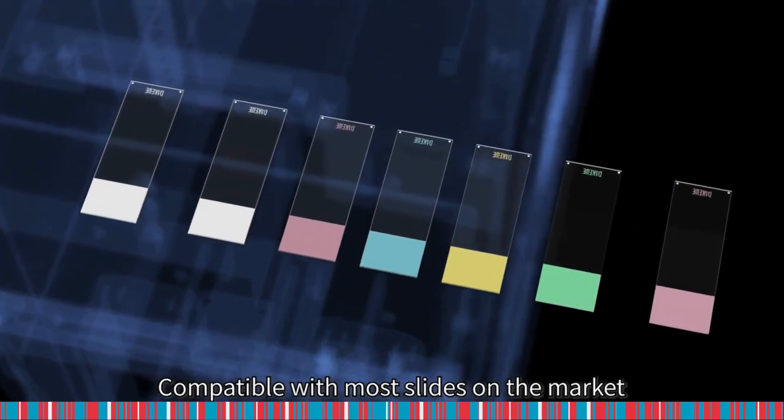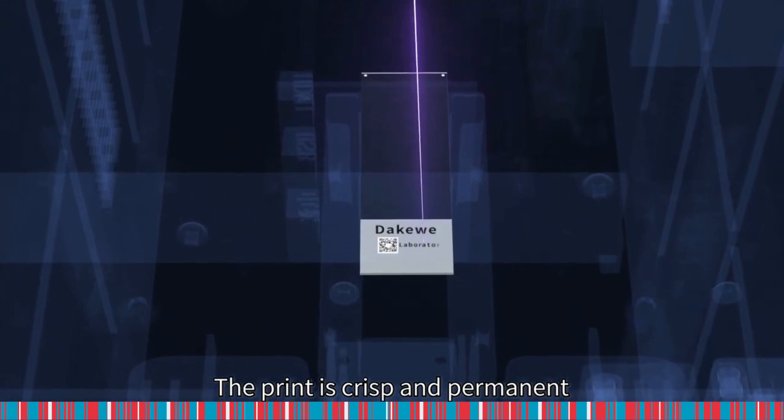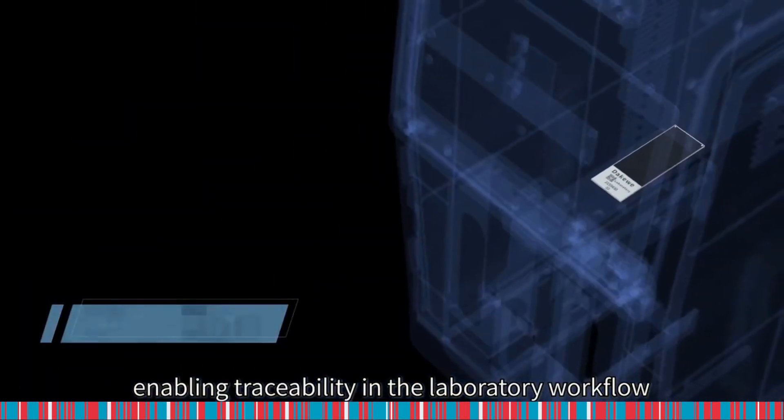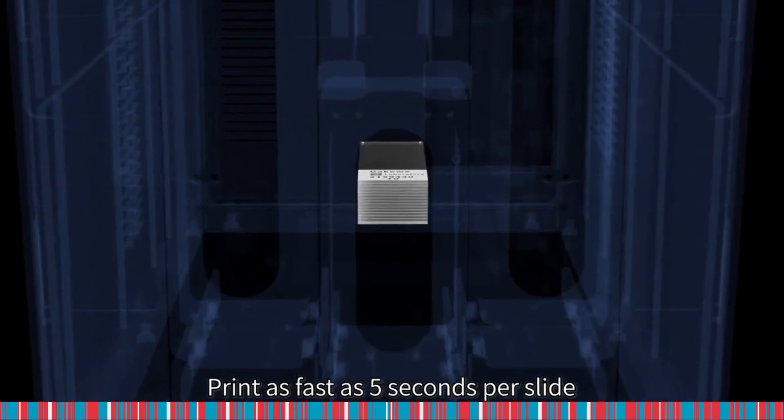Compatible with most slides on the market. The print is crisp and permanent, enabling traceability in the laboratory workflow. Print as fast as 5 seconds per slide.